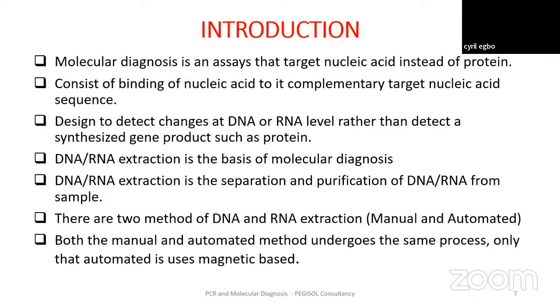This DNA extraction is equally known as DNA purification. So it's purification of DNA.